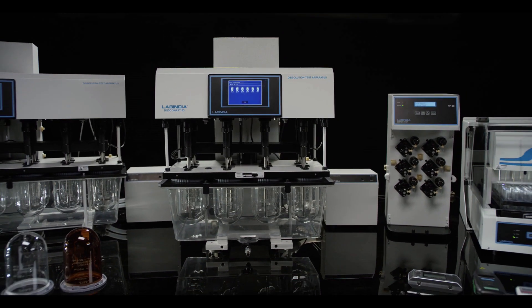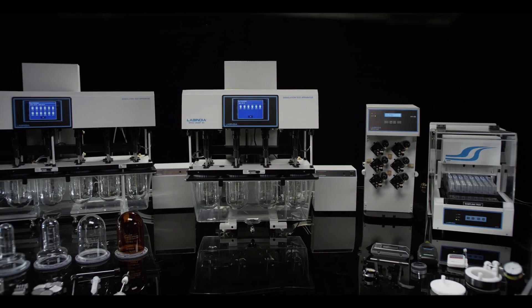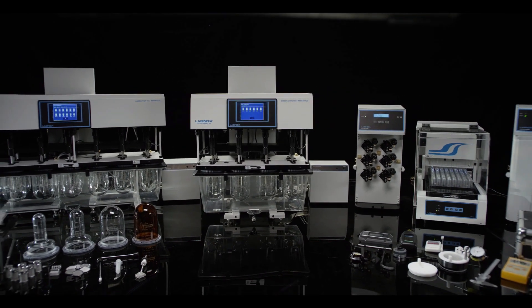Lab India's tablet dissolution test apparatus smart series — trusted by leading MNCs across the world.